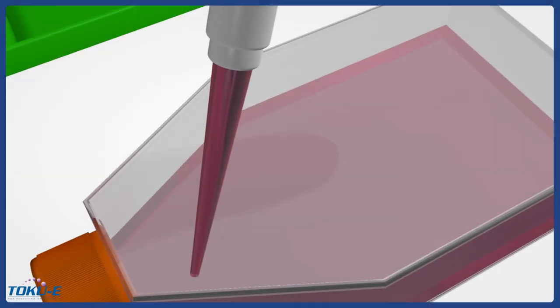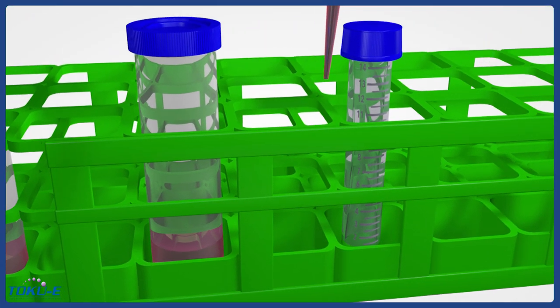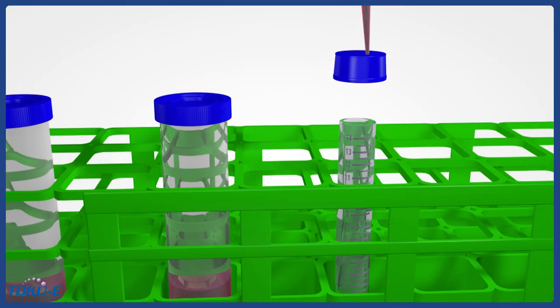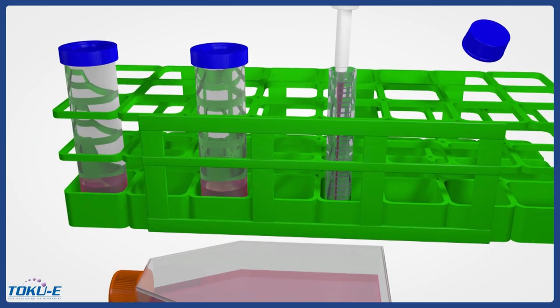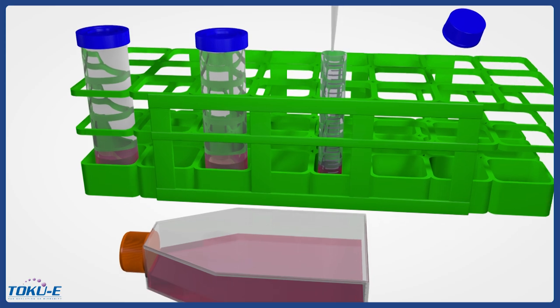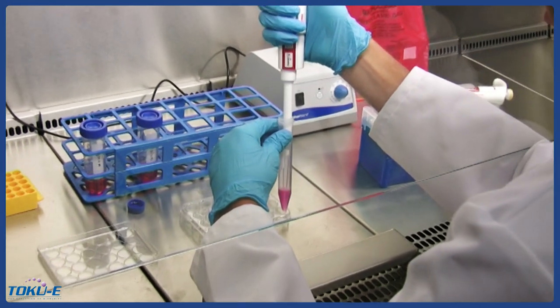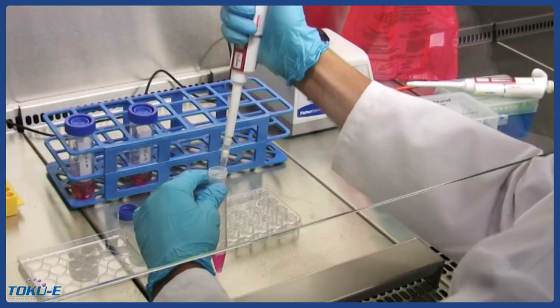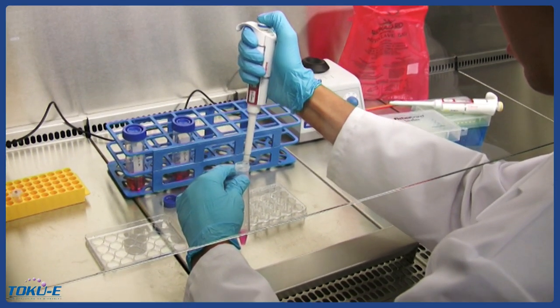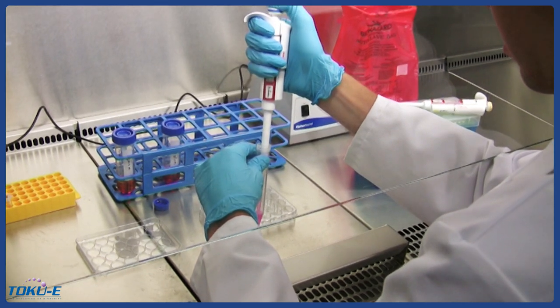First, prepare a 15-milliliter tube containing a 2-milliliter parental cell suspension. The cell concentration used should be the same as the cell concentration that became 80% confluent after 24 hours of incubation, as determined in the previous kill curve step. Add 500 microliters of the cell suspension in three different wells in a 24-well plate. One well will be used for transfection, and the other two will be used as positive and negative controls.